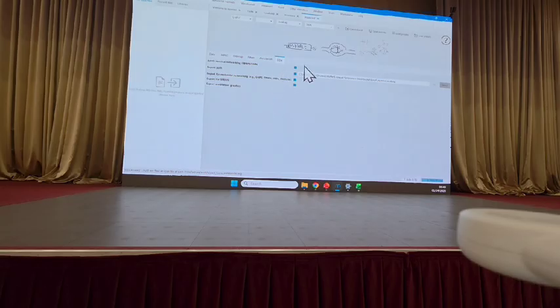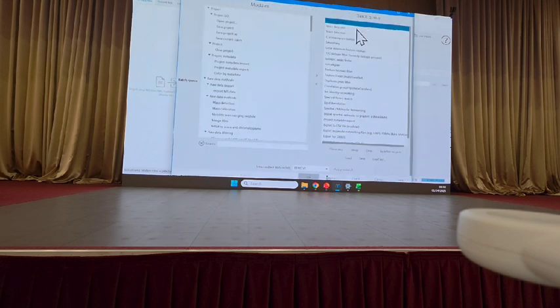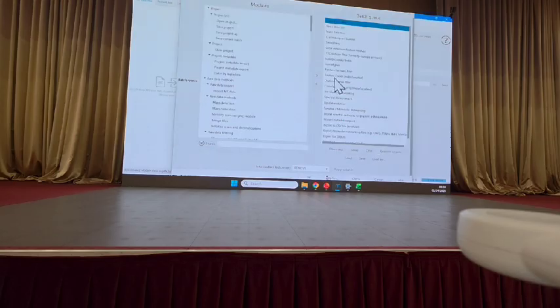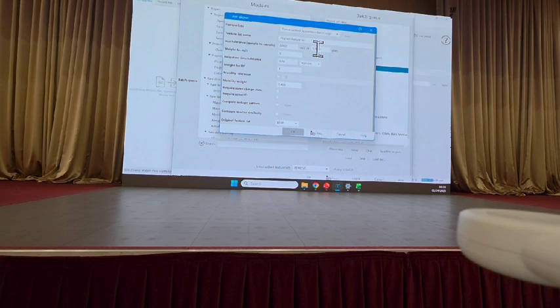So once everything is filled out, I will press create batch, and boom, it makes this nice batch that I can process all my data with, and it already has everything filled out. It will import the data for you based on what you selected, it will import the metadata, and it will import the spectral library. It will do all the steps, and again, there are a lot of parameters that we didn't cover, but the wizard extrapolates the best parameters based on what you put there.